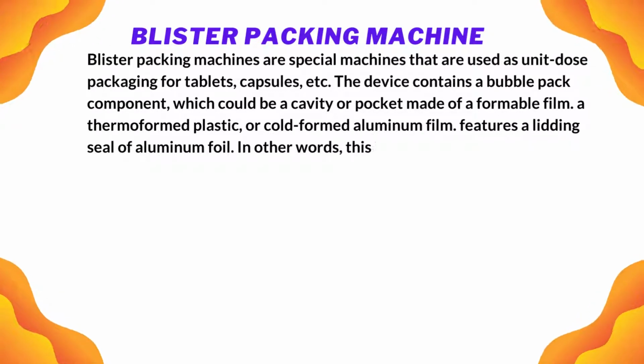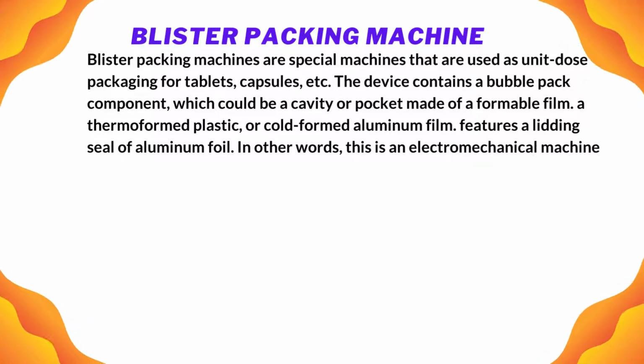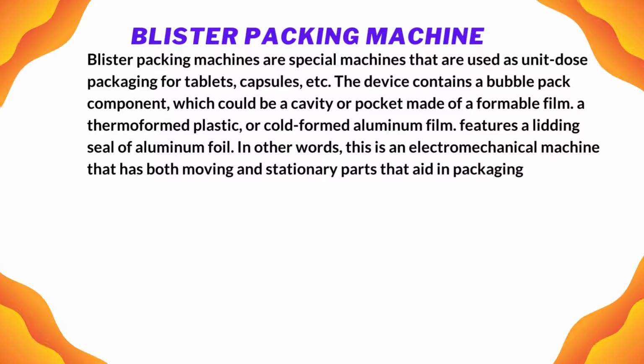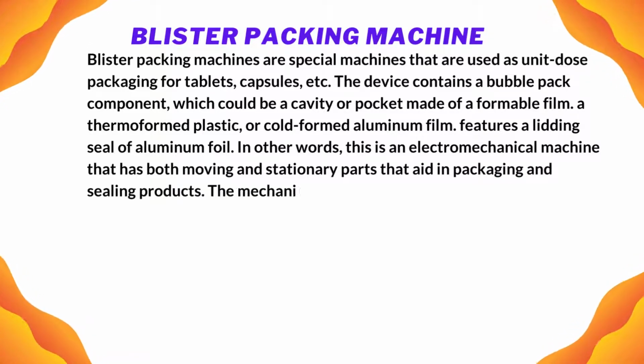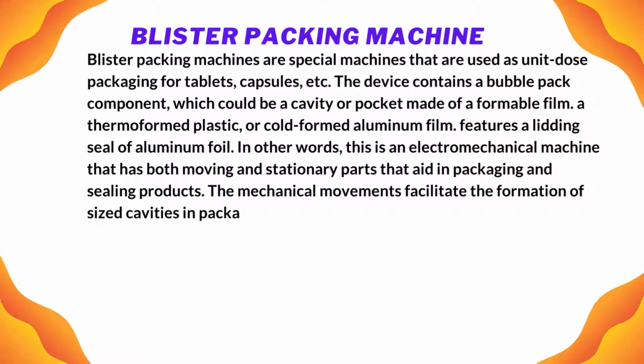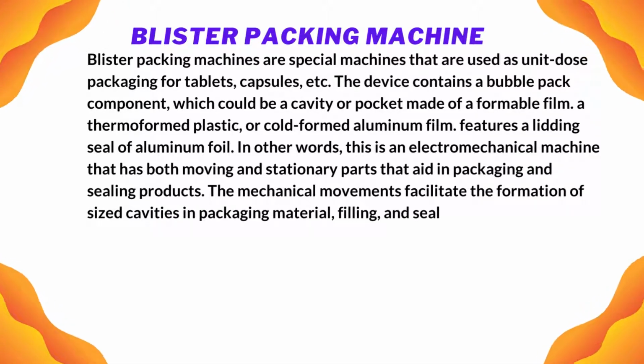In other words, this is an electromechanical machine that has both moving and stationary parts that aid in packaging and sealing products. The mechanical movements facilitate the formation of sized cavities in packaging material, filling, and sealing with appropriate materials.